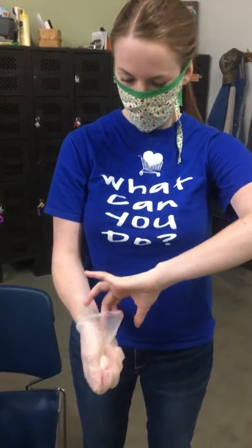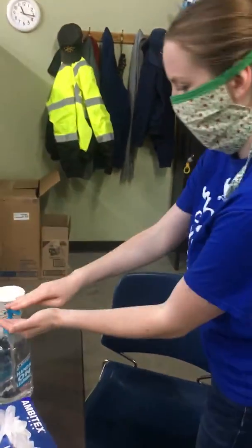And now we're going to show you how to take these off. You first remove your gloves correctly. Notice she pulls it off, holds the dirty glove in one hand, slips her hand under where it's clean, drops it into the trash, and does her hand hygiene. Following hand hygiene, she removes the mask. She undoes the top strap, and if it's the ear ones, you just take it off over your ears.